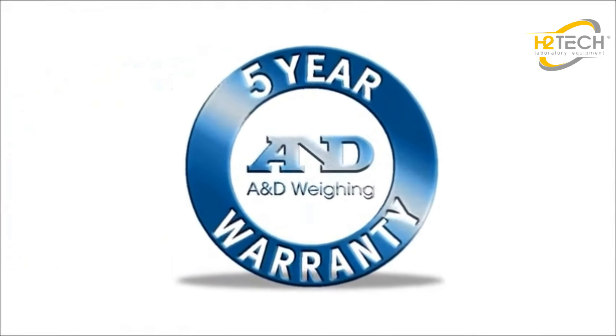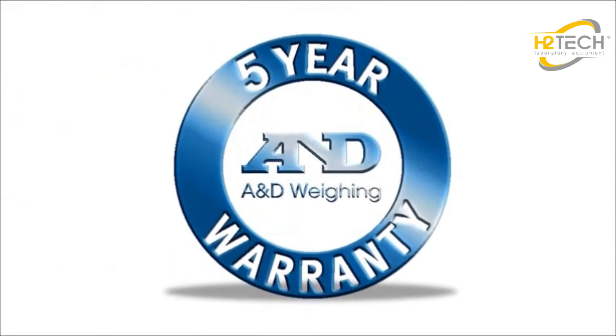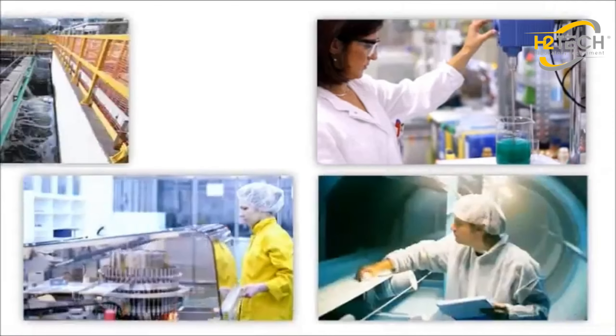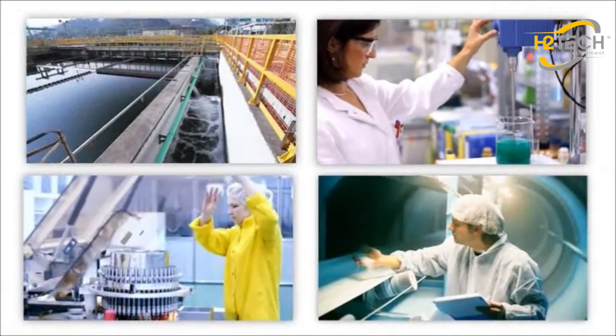A&D Moisture Analyzers are backed by the industry's best warranty, 5 years, and have a proven track record of years of service. They can help you improve your product and your processes.